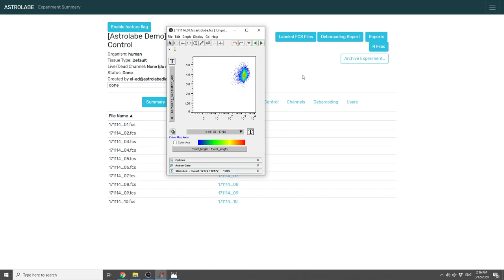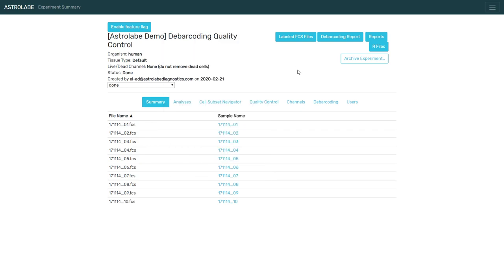Now to clarify, I'm showing all of these metrics through the lens of Astrolabe. However, these are available through the Fluidigm debarcoding software through the, if I recall correctly, the PREMESSA package. So these same metrics exist in other software tools as well.